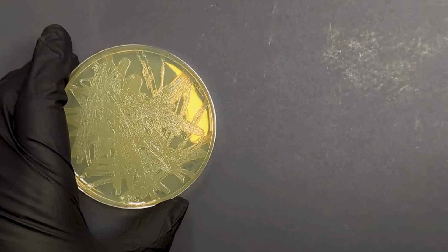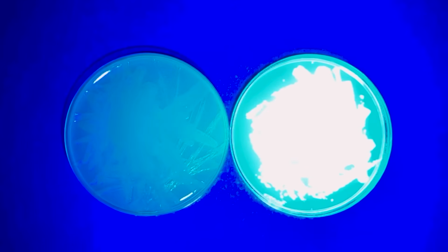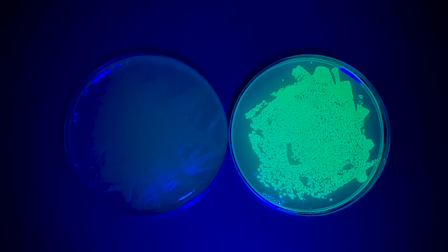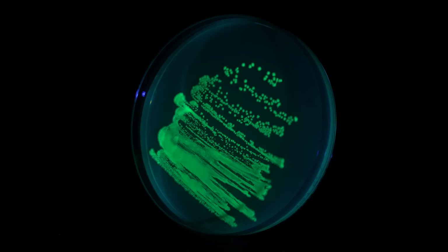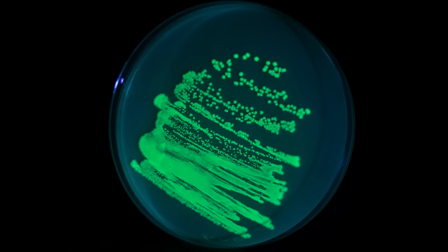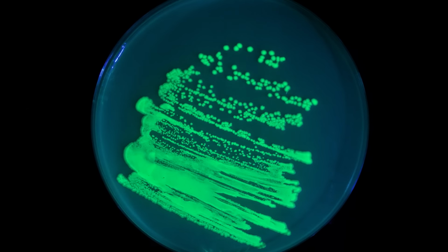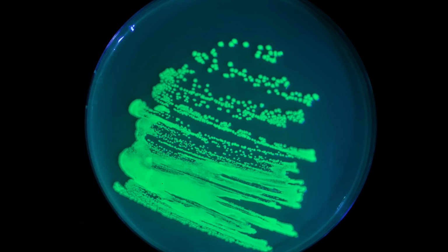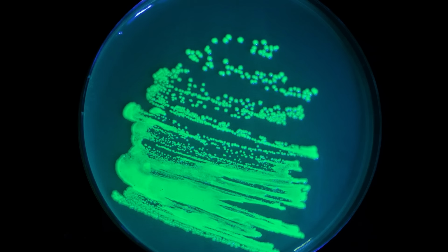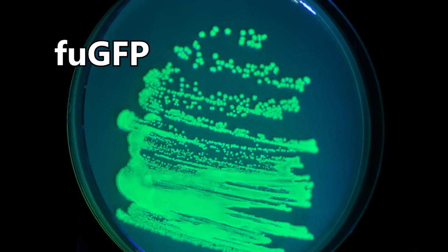As a refresher, here is a regular plate of E. coli. Now, here's the one with the green protein. It already looks distinctly more yellow, but look what happens when I hit it with a UV light. It is so bright, you could comfortably read a book with this glow. Using a fluorescent protein like this is called using a reporter, because the glow is our signal, or report, that the modification worked. If we see it, we know the DNA must be present, so there we go, that's our hello world done. And this green, known as Fu-GFP, is easily my favorite.